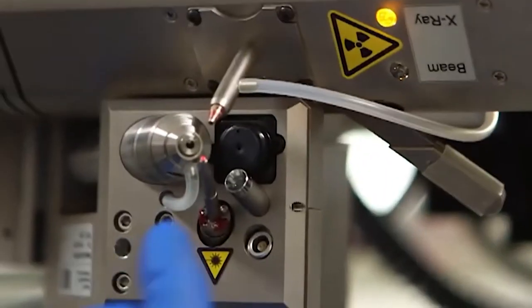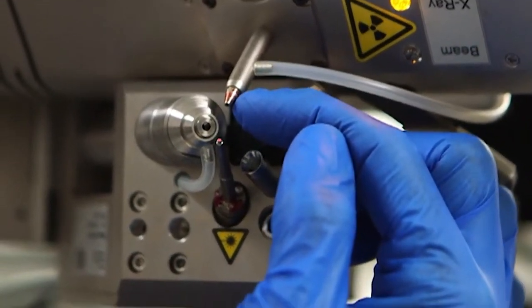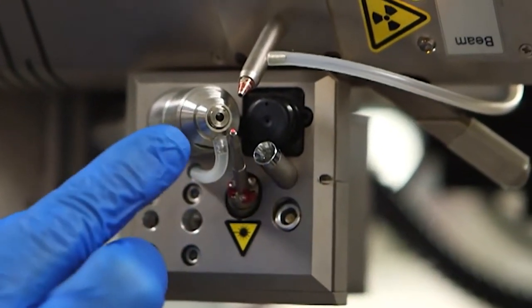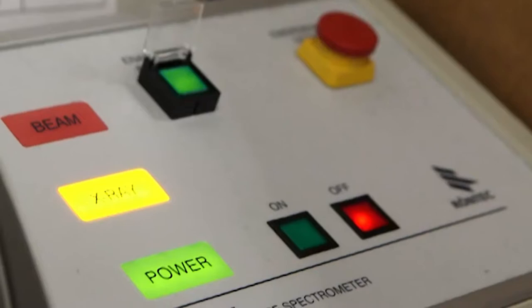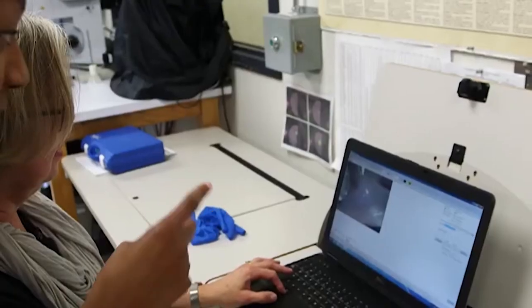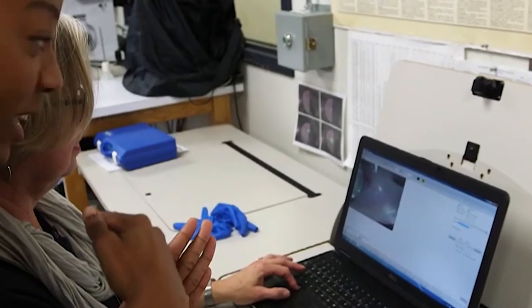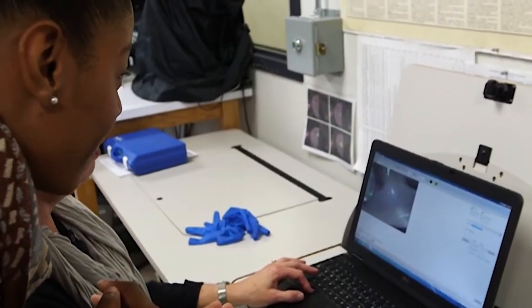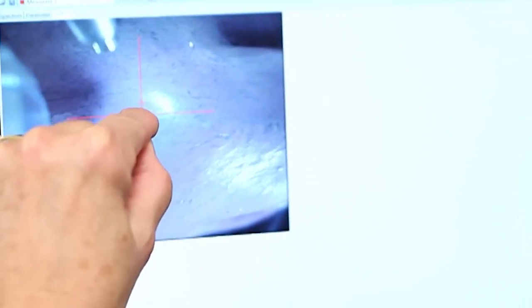The X-rays will come out this little red-tipped orifice here. This is a video-guided system, and the X-ray beams will hit exactly where the crosshairs and the laser pointer intersect. She aligns the laser and the crosshairs together to get that perfect point. This graph is showing us what elements are present in the paint.